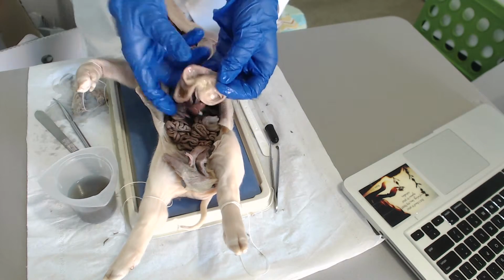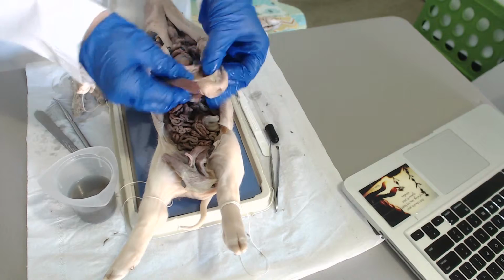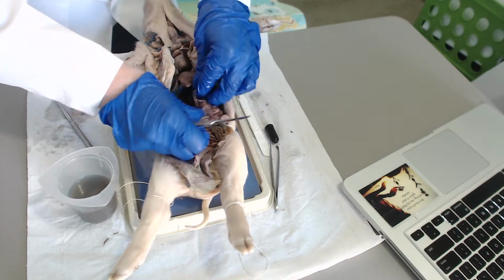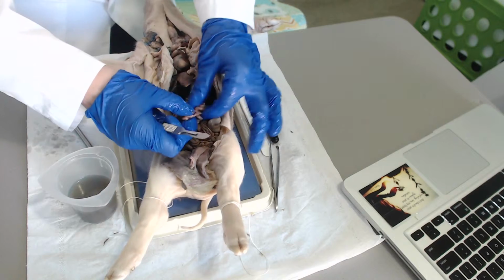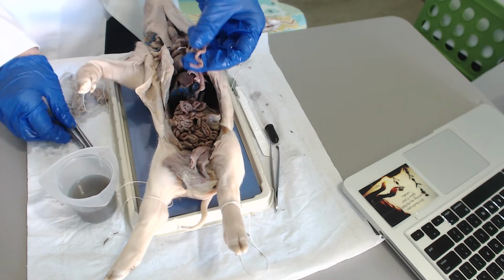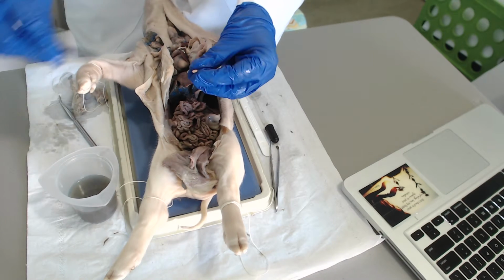Okay, so we're going to also open up the small intestine. We're just going to take a piece of the small intestine out. So here's a portion of the small intestine. You can see it still has fluid inside.